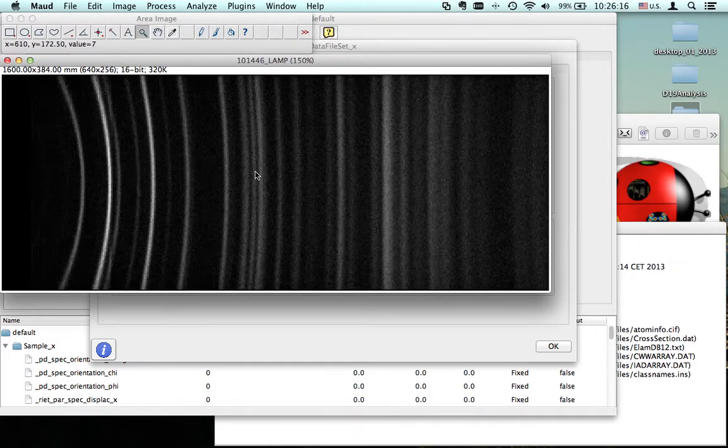So you see eta 0 is just over here, and then when you go out of here along this circle, you go positive eta here counterclockwise and negative eta here, and the center is over there. If you have the 0 not over there, but in the other direction, for mount you need to reverse the image, so do a flip, okay? Because you need the zero on the left, so 2 theta should decrease going to the right. The 0, 0 of x and y is over here. And you can also check the value.